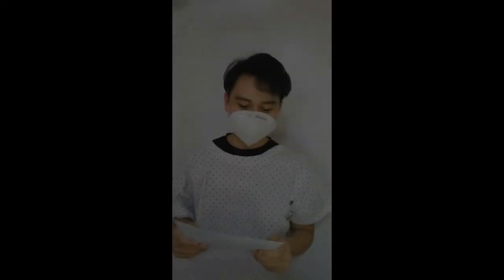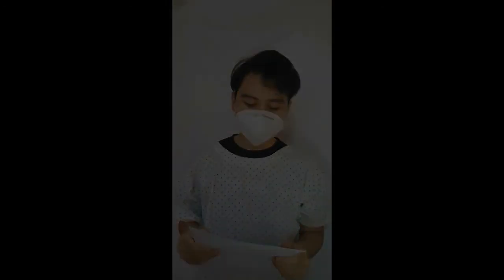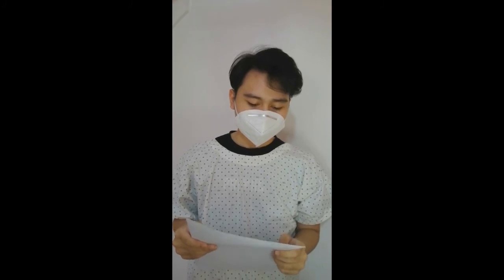For this experiment, we're going to observe a physical change in the properties of water. First, place a few drops of water on a piece of wax paper. Notice its rounded appearance. Touch a toothpick to the drop of water. Nothing should happen. Second, dip the toothpick in a container of soapy water and touch the drop of water again. Observe what happens.